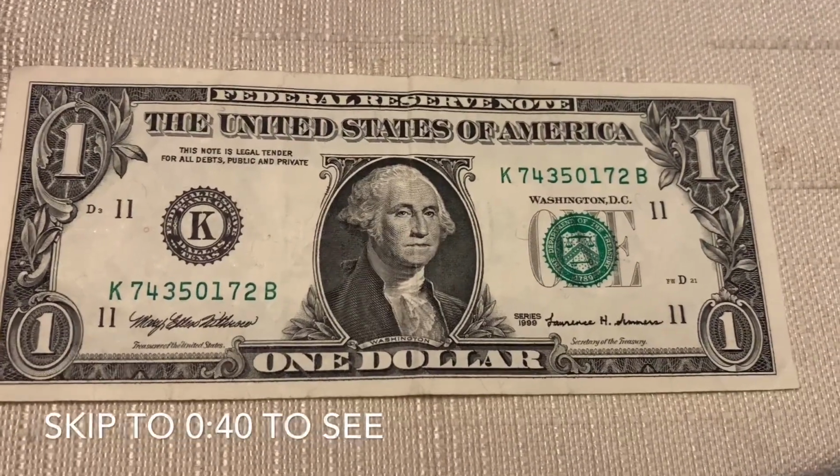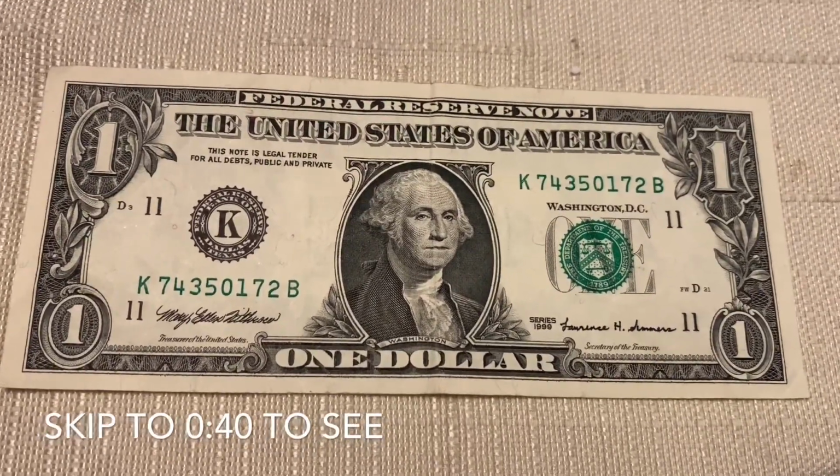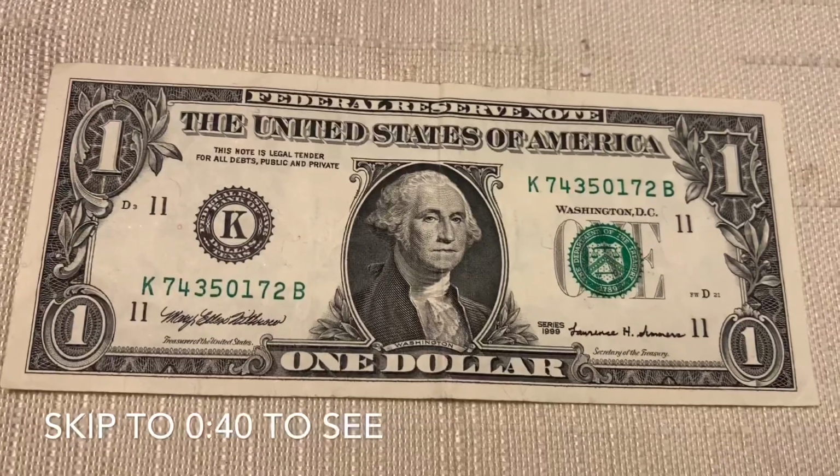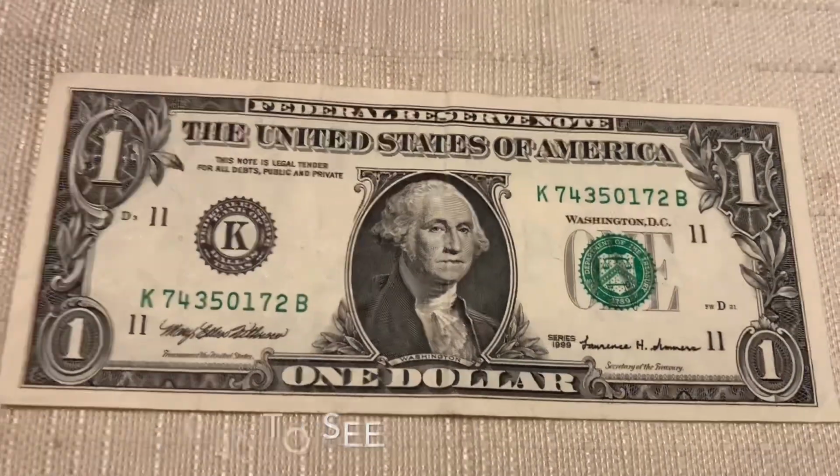Today in this video, I will be looking through a $1 note in a microscope. This is a $1 Federal Reserve note printed by the United States of America with President Washington on the front. This particularly is a 1999 note, and I will show you exactly what we're looking at through the microscope.